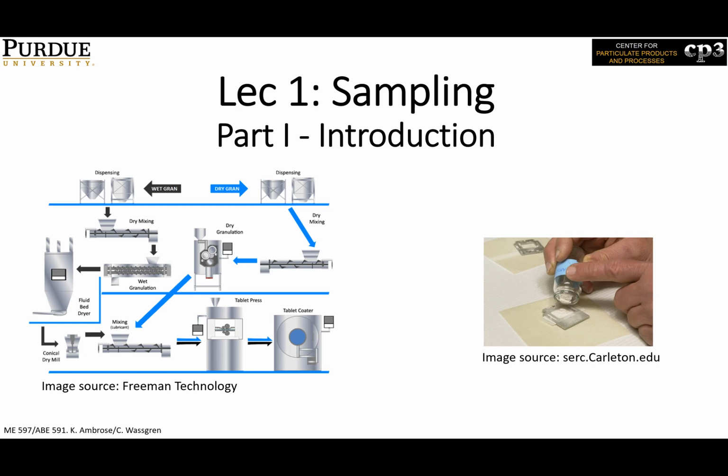In almost all the powder processing operations, sampling is the first step in characterization. So we collect a small amount of sample to analyze the physical and or chemical characteristics of the product. Unfortunately, this is the place where we knowingly or unknowingly introduce bias. So let's look at some of the standard sampling methods, procedures, and ways to reduce sampling errors.